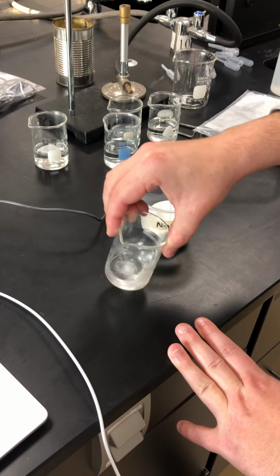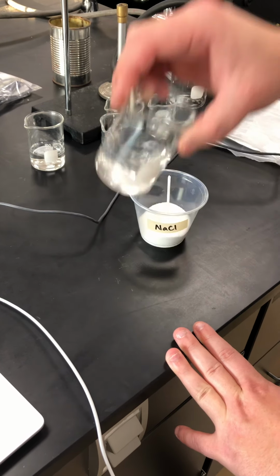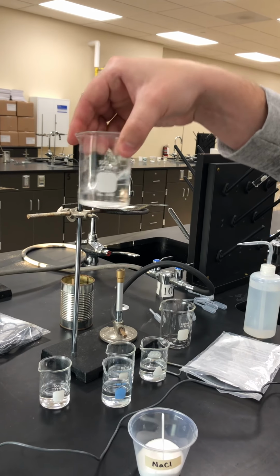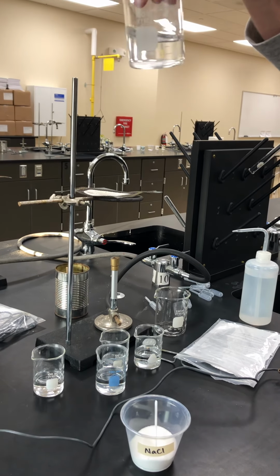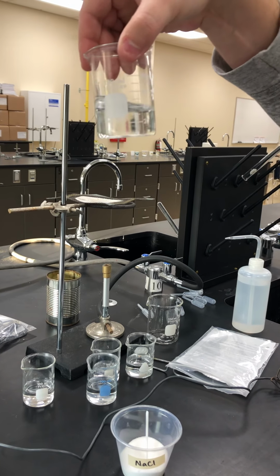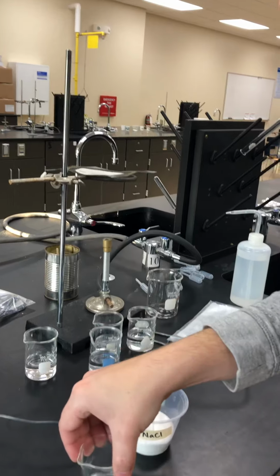Give it a little stir. And most of it has dissolved. There's a little bit on the bottom, but I can clearly tell that a lot of it dissolved. So this was the sodium chloride.